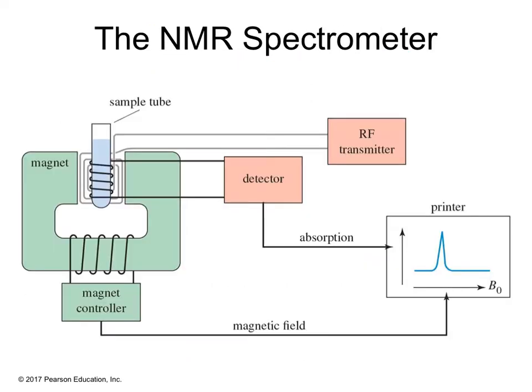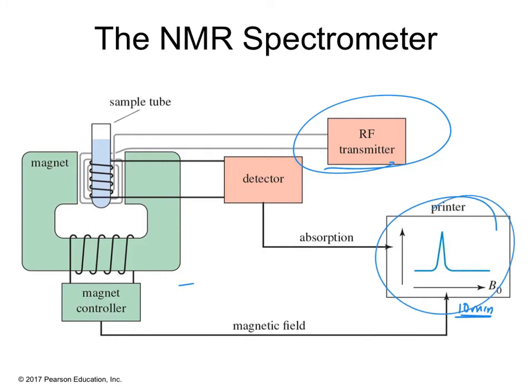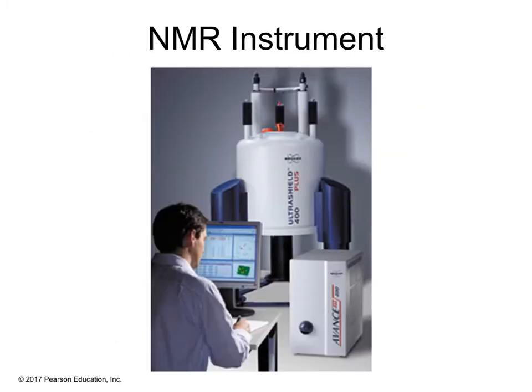This is the NMR spectrometer. If you're going to do spectroscopy, you're going to do some research, you will end up putting your compound in the sample tube, you'll put it in the big magnet, you will turn on the pulsing, and then in about 10 minutes, maybe less than that, you'll get your nice printout of your spectra. And it's something like this. So you'll have an NMR room. I would suggest that you put all your phones and anything magnetic not close to this 400 megahertz NMR.